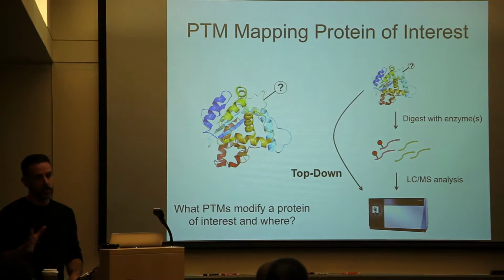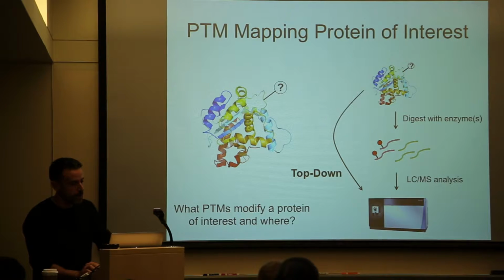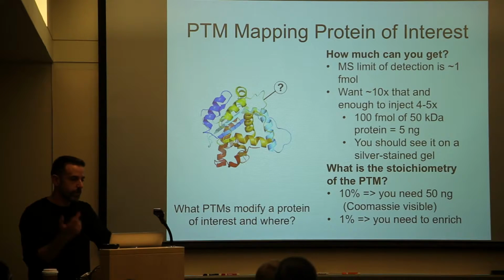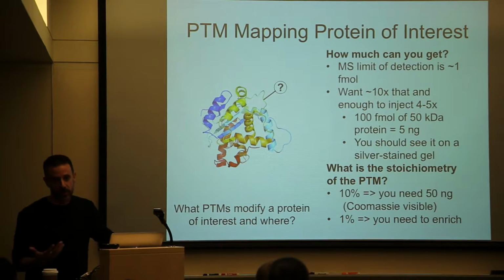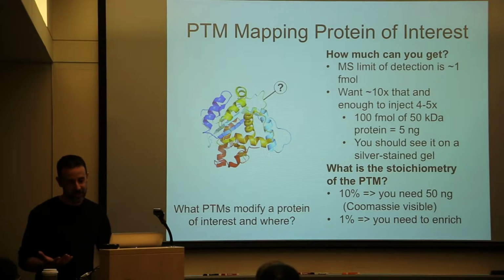It's not easy, it's very protein dependent, but when it works, it's a beautiful technology. But that's not what I'm going to talk about. So when we're mapping a PTM of interest, you come to me and you say, what PTMs are on my protein? I come to you and I say, how much of it can you get?